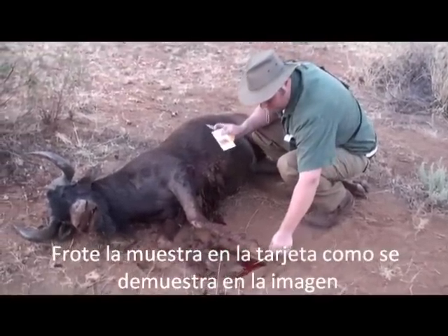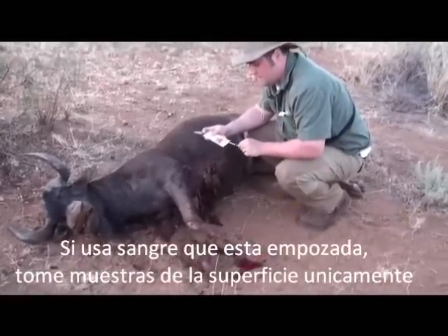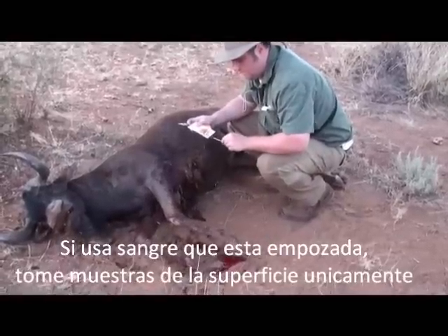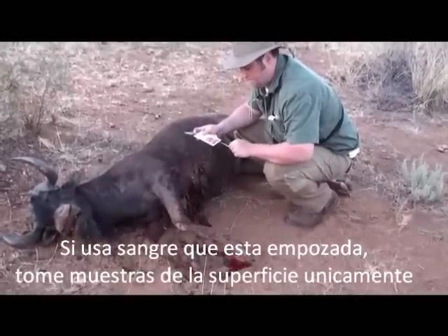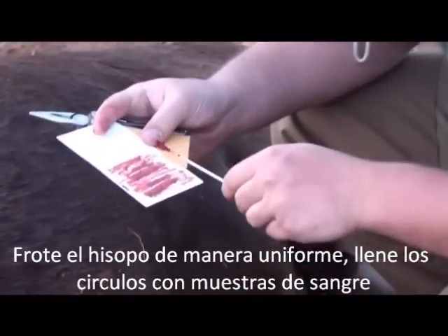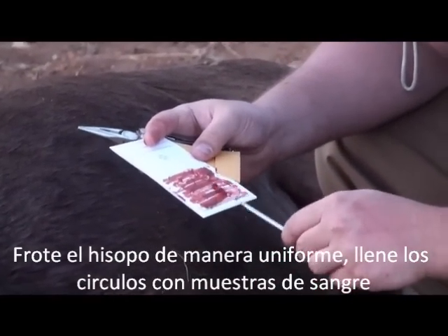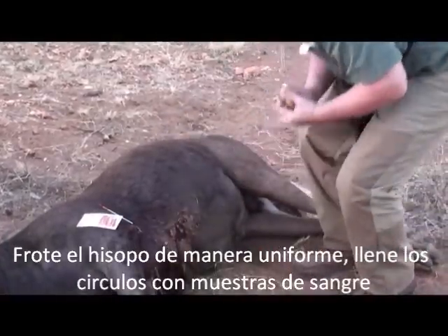You want to do that only if it's really good and clean. You wouldn't want to do it in a bunch of muddy water or something like that. But that blood is perfect. Just like that — nice blood sample. We'll stick that right there to dry.